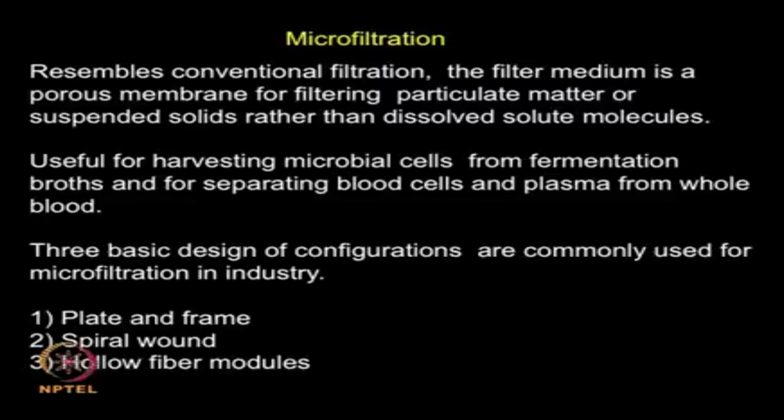Microfiltration is almost like an early stage; instead of a normal filter cloth we can resort to microfiltration. It can be used for harvesting microbial cells. If I am interested in intracellular material, I can use microfiltration from fermentation broth. I can use it for separating blood cells and plasma from whole blood.